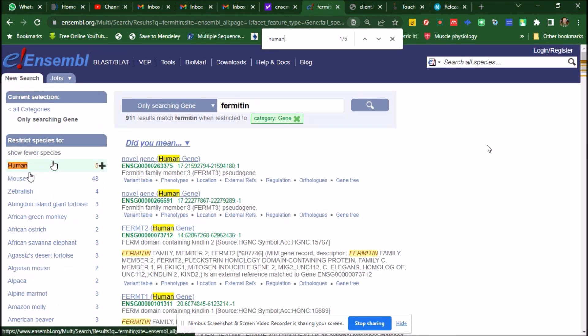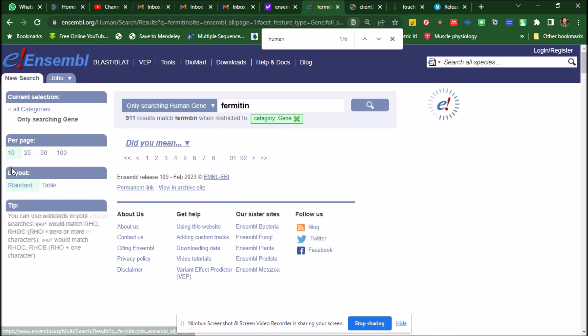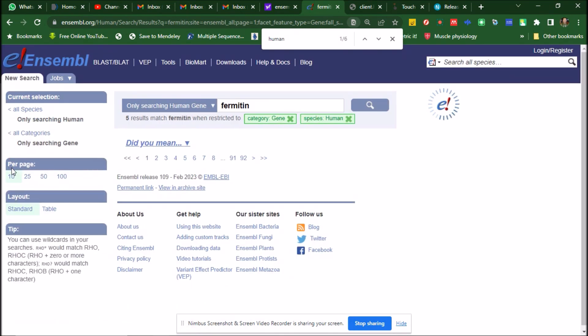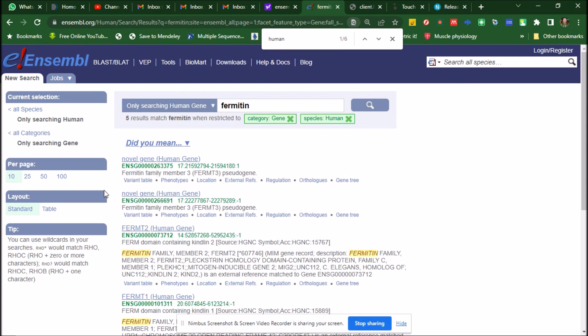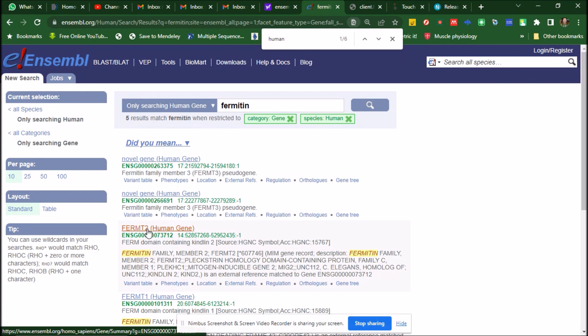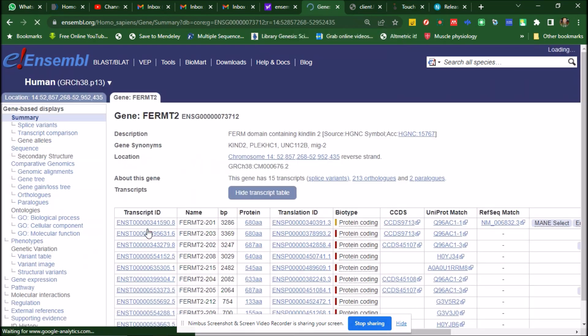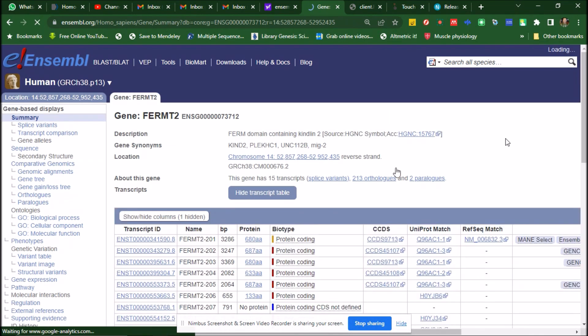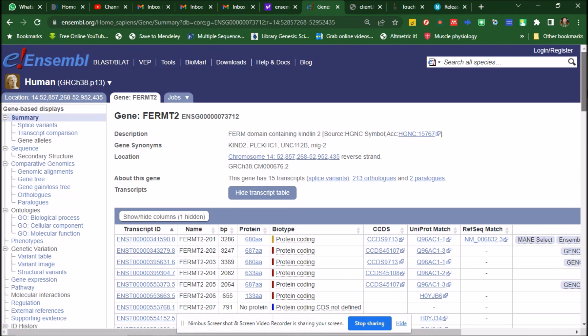And now, this novel gene, this FERMT2, let's say we go for it. FERMT2 is fermitin 2. And now this is the gene. This is all about, this is something similar to what you saw in the NCBI Browser.